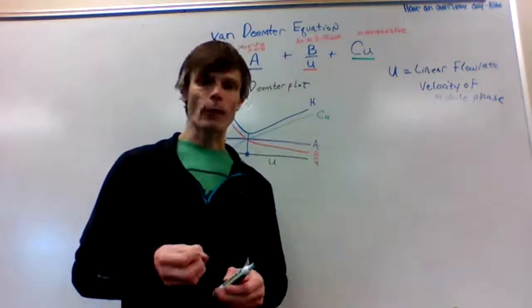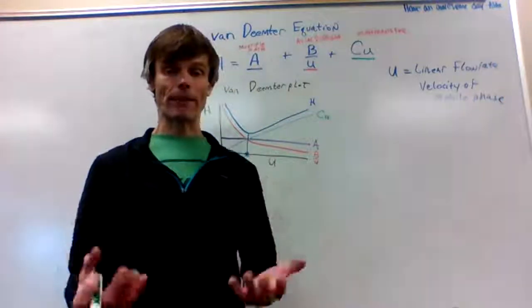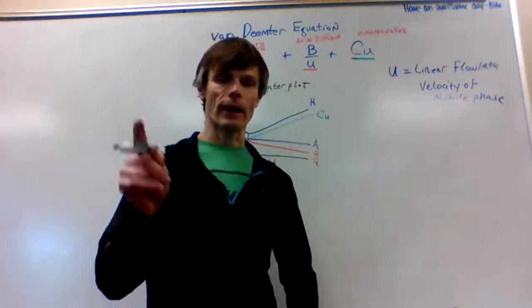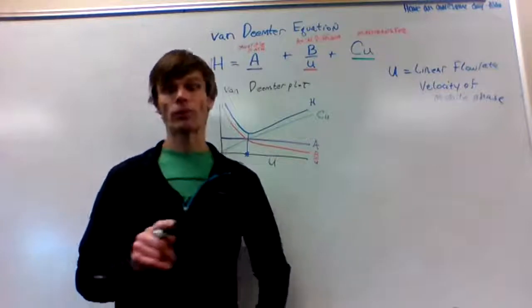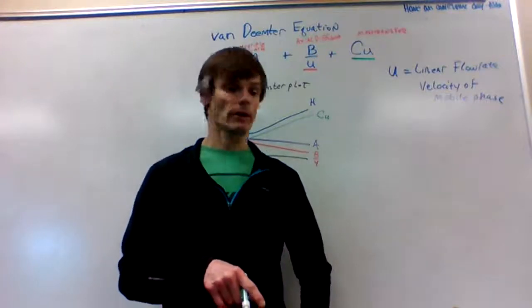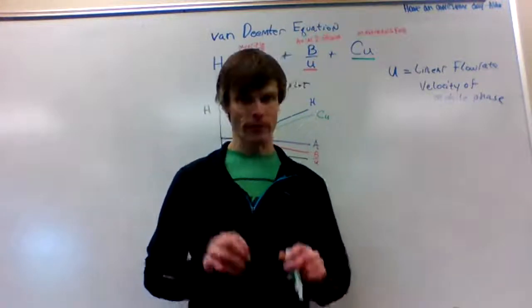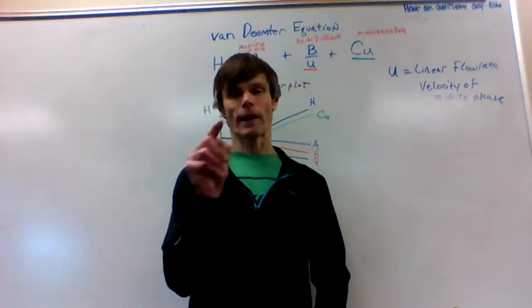The first topic we'll start with, I'll review it, is how we can categorize or classify our separation as being either a normal phase or a reverse phase. And I'll just tell you right now, normal phase is when we have a polar stationary phase. Reverse phase is going to be a non-polar stationary phase. And that's how we define it. We'll go over that in more detail next time.